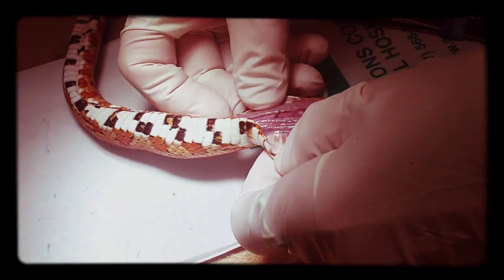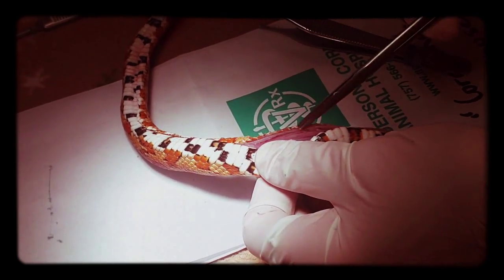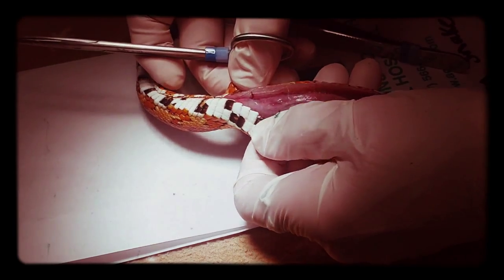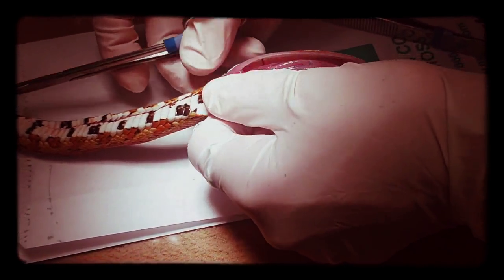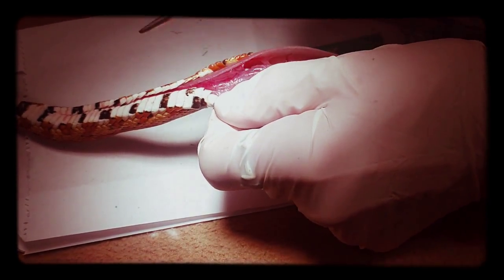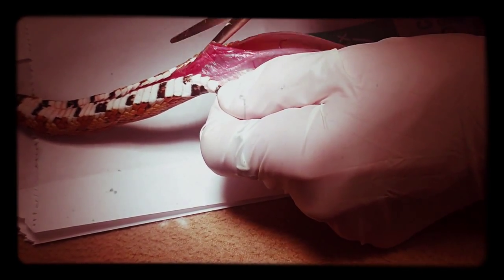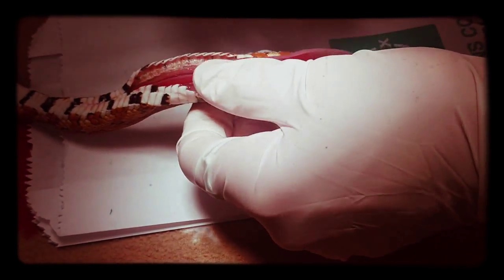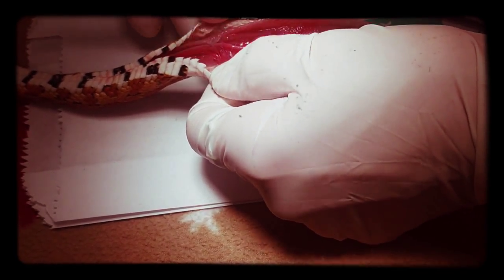Okay, let's do that now. Oops, that's where I injected euthanasia solution, so a little bit of hemorrhage for it.